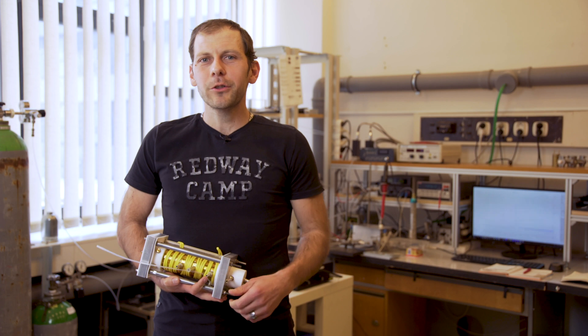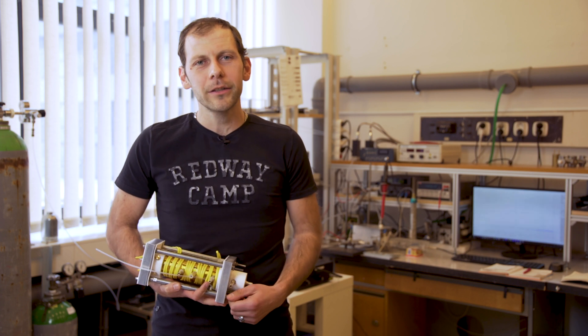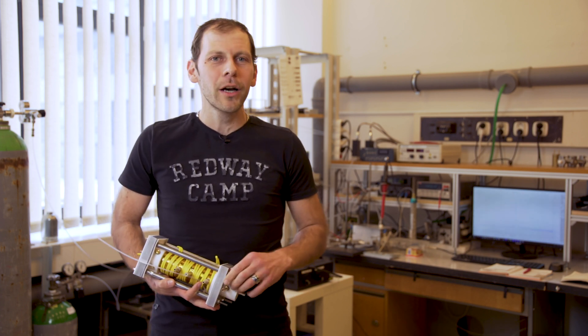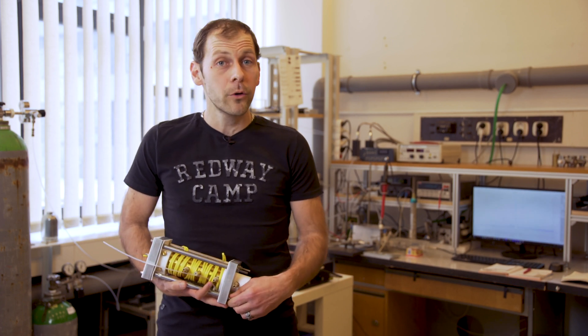I am Vladislav Morawski from the Komenews University. Welcome to our lab in the ion mobility spectrometry and mass spectrometry. It's a little bit noisy here because the pumps are turned on because we need some vacuum to work with this equipment. I'm sorry for that, but I will show you how this equipment works.